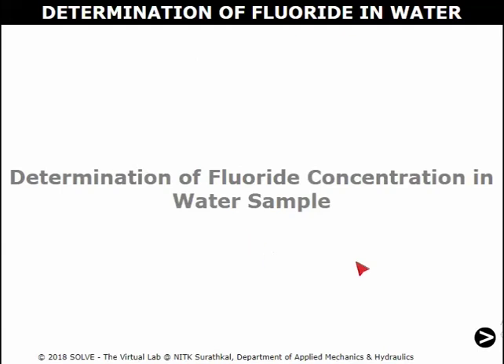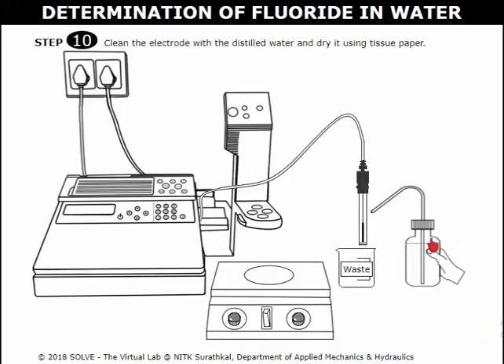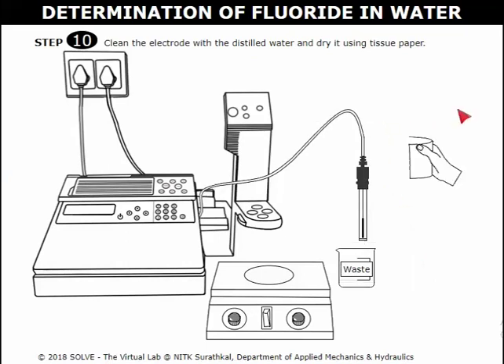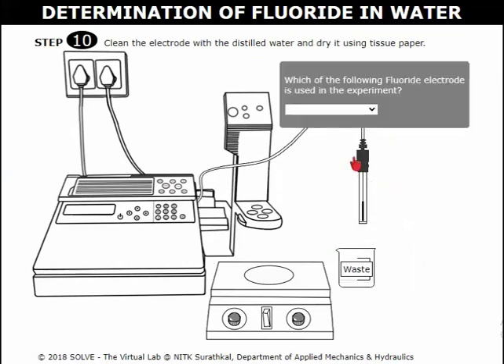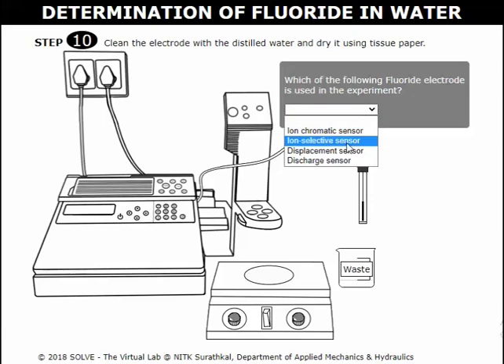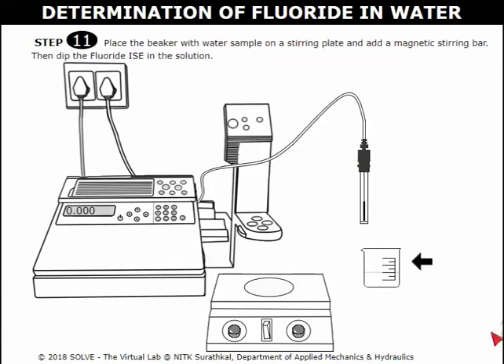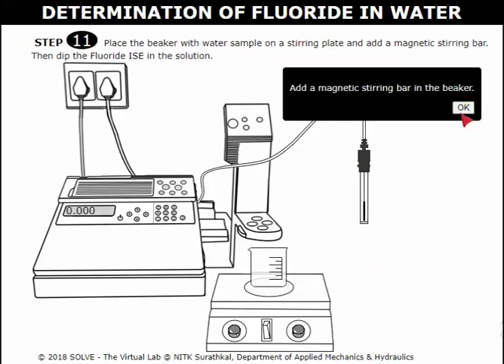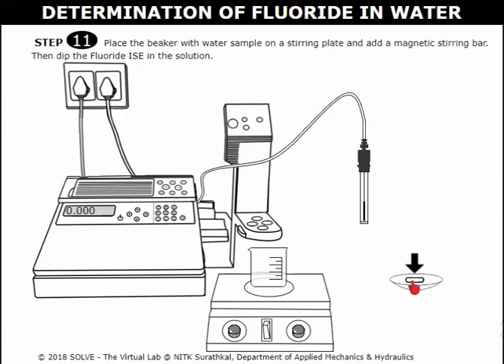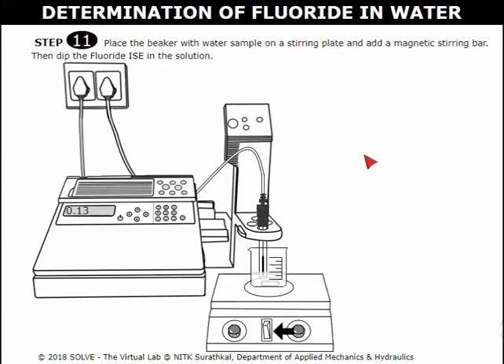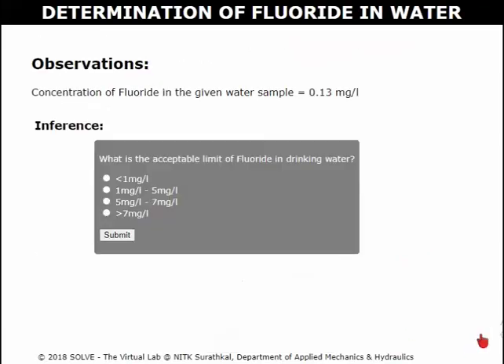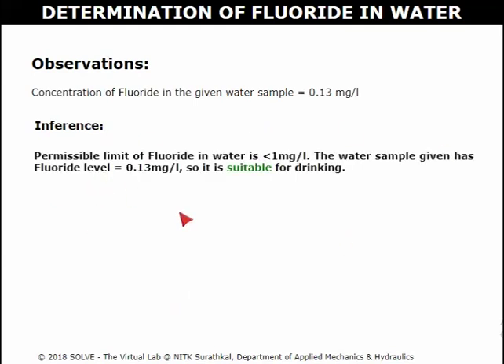Determination of fluoride concentration in water sample. Click here to clean the electrode with distilled water and dry it using tissue paper. Select the correct answer for the pop-up question to proceed to the next step. Click here to place the beaker with the water sample on a stirring plate. Click on the magnetic stirring bar to place it in the beaker, then click on the electrode and dip the fluoride ISE in the solution. Switch on the magnet stirrer and stop the stirring after getting an accurate value. Select the correct answer for the pop-up question to proceed to the inference. These are the observations for the current experiment, and we can view the inference drawn from this experiment.